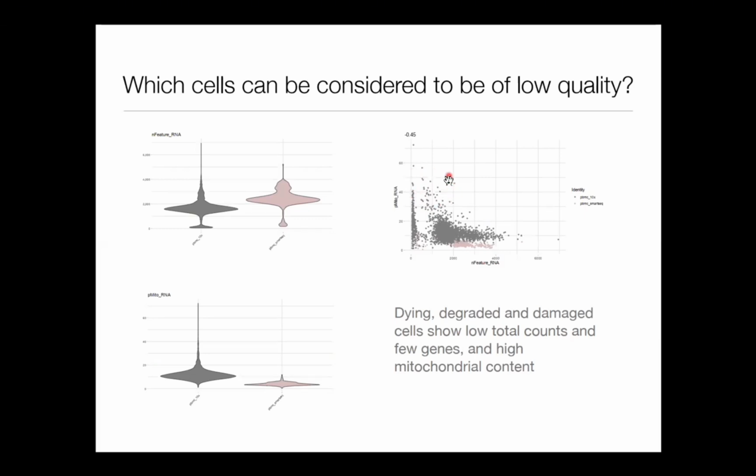Okay, that is what we flag as low quality cells. To be honest, at this point, I don't remove them yet. I always like to keep everything in for a first round of analysis to see what's in the data. And then later I come back and revisit the quality controls.